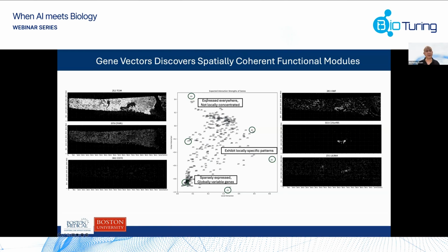Right. And the next question from the audience. When you import the polygons, do you have functions to calculate the count metrics, essentially finding which transcripts belong to which polygon? Sorry, can you say that again? So when you have the cell segmentation represented as a set of polygons, and you have transcript locations, do you have functions to generate the count metrics?